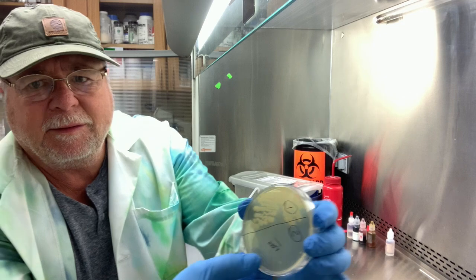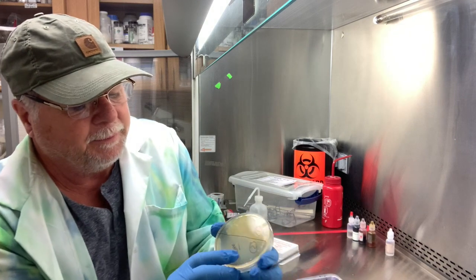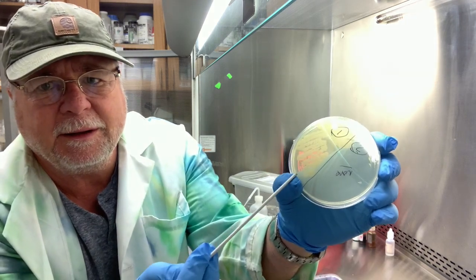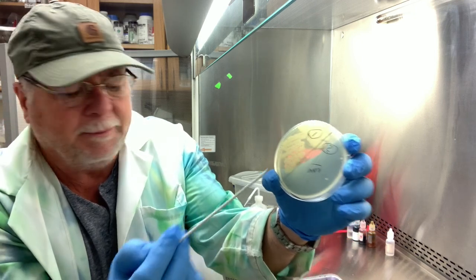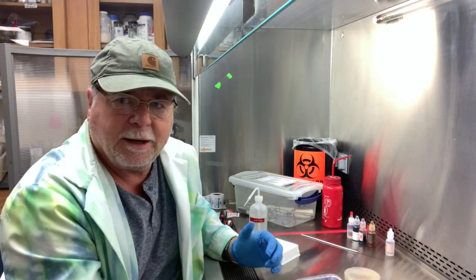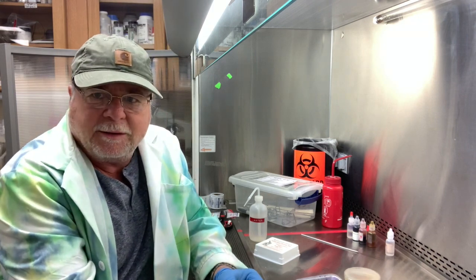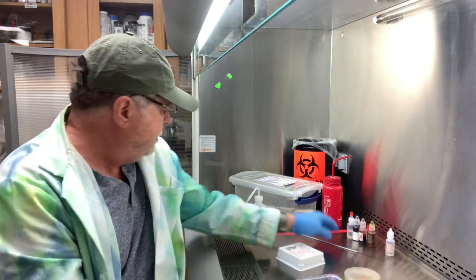You can see on this plate that there are nice colonies. When you do a streak plate, we'll do that in the next one, you want to end up with these little isolated circles. Right here's one isolated, so it means it's not touching another. That would be a pure culture, or a pure colony, and that's what we want when we're looking at a microscope. It doesn't do you any good to try to identify something if it's not in pure cultures.